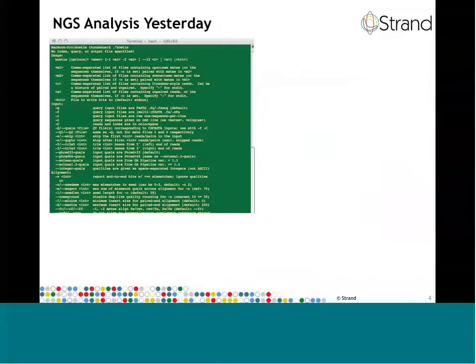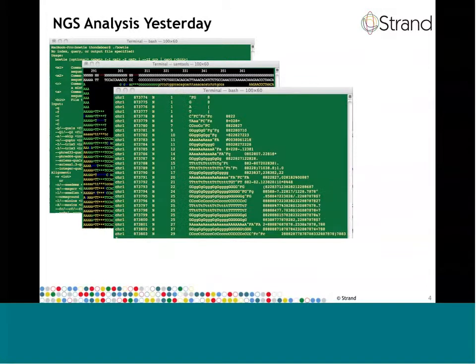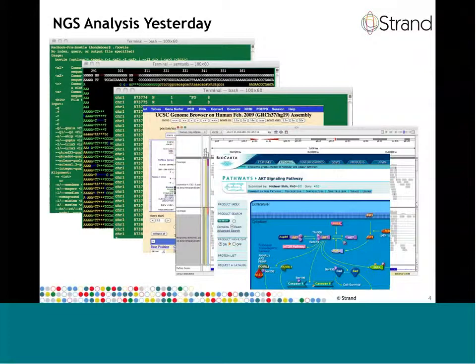But in order to get answers to these biologically relevant questions, many researchers find themselves having to deal with esoteric command line applications, many of which require extensive knowledge of computing environments that have basically not developed since the 60s. And to get to the underlying biologically relevant information, a researcher often finds themselves jumping from one program to the next website and back again, which often is accompanied by data translation steps and file format changes. But many biologists did not go into biology to become bioinformaticians, but they wanted to do real research.